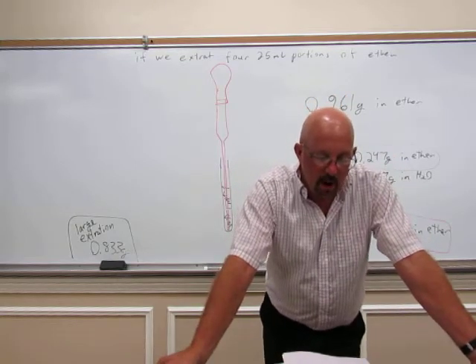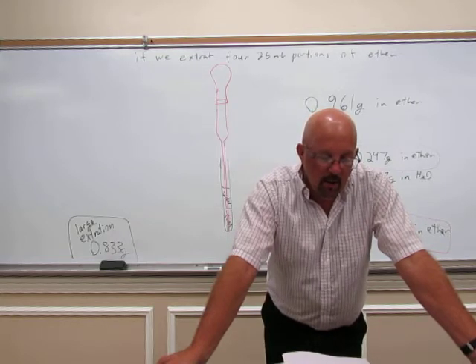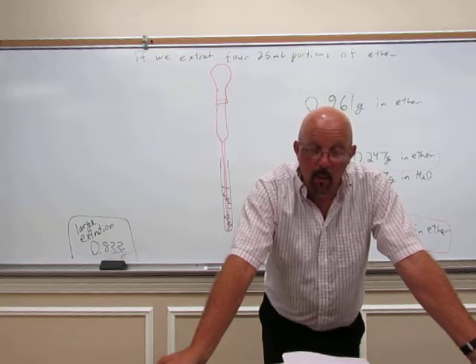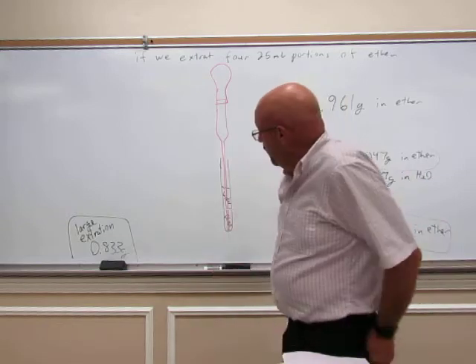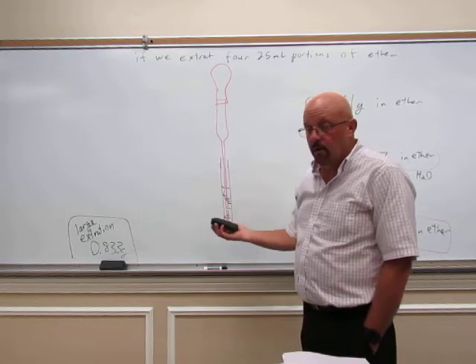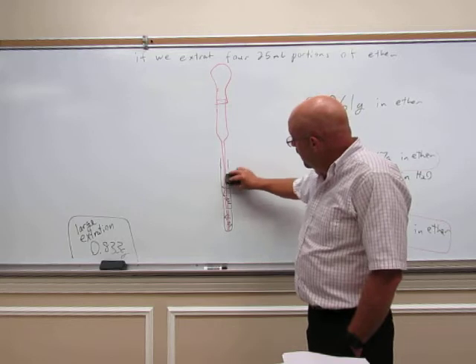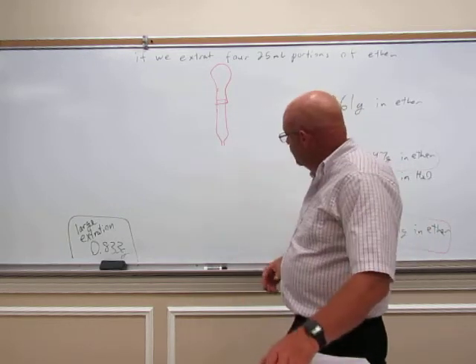Now, once it's dried, once it's had 5 minutes to dry, you're going to take and pre-weigh a 10 milliliter Erlenmeyer flask that's in your kit. So go weigh it empty, write that weight down in your notebook, and then you're going to transfer the organic layer that's on our pellets. You'll transfer the liquid over into the Erlenmeyer flask.